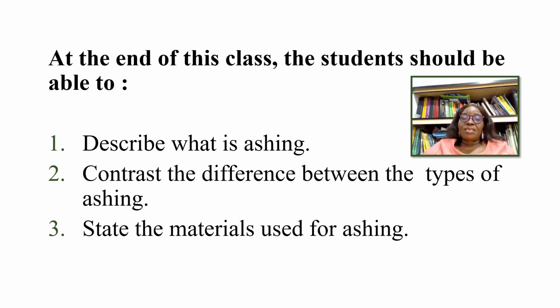At the end of this class, I expect my students should be able to describe what is ashing, contrast the difference between the types of ashing, and state the materials used for ashing.